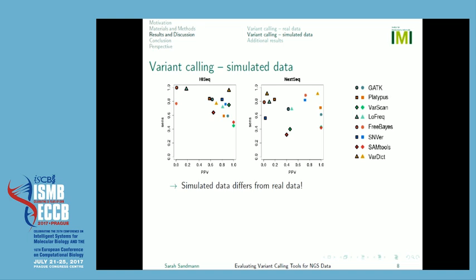The details are not that important, but what you can see in the plots is all kinds of symbols, and this is not really good, because when the data was actually matching, you would not see only one kind of symbol. But this just means our simulated data differs quite a lot from our real data, and overall you can see a shift to higher PPVs, and we think that this can be observed because our simulated data was somehow completely lacking systematic errors.